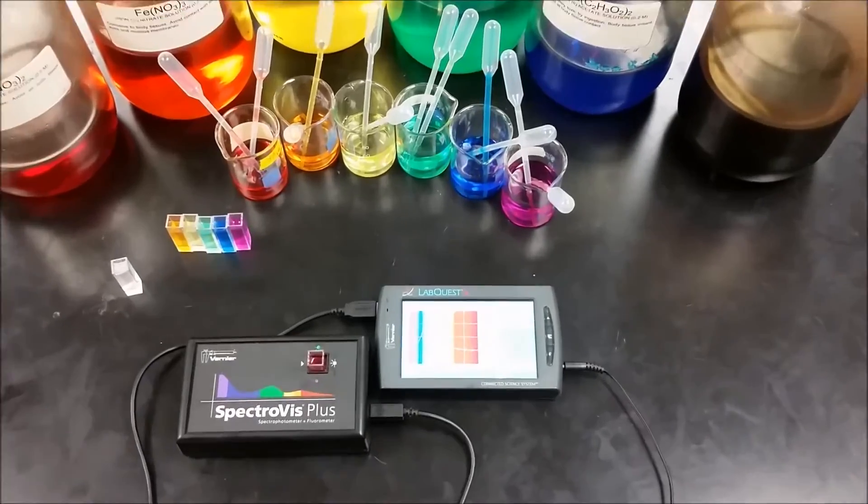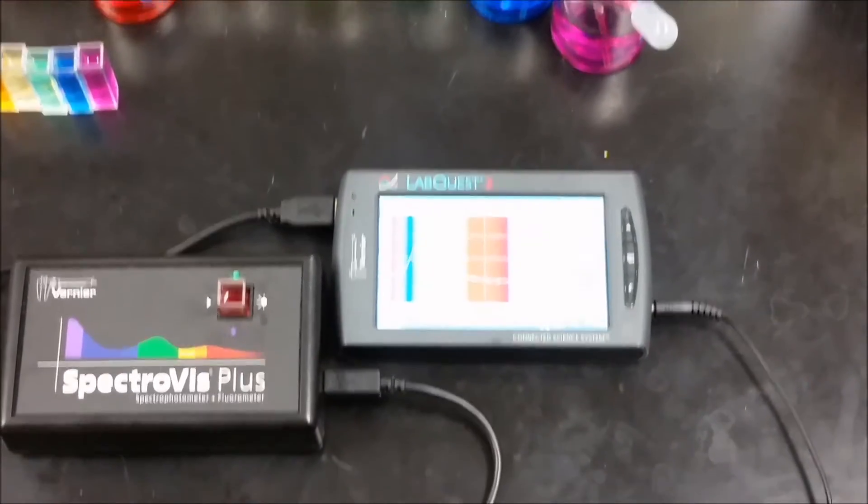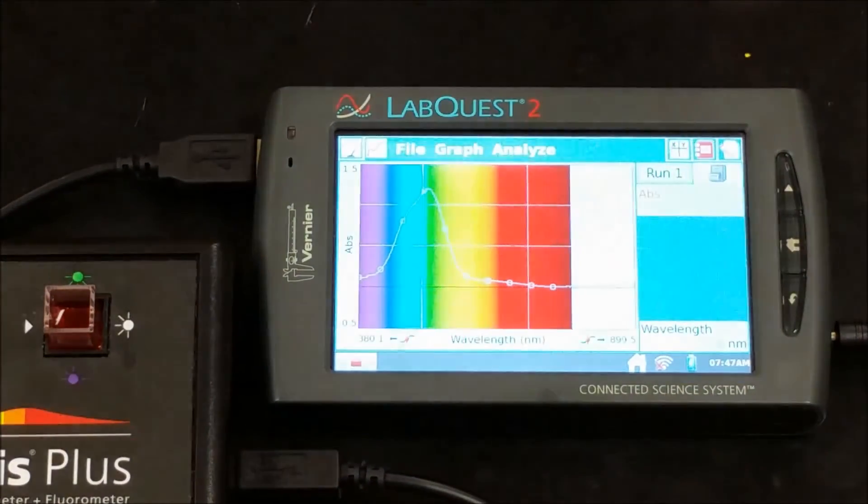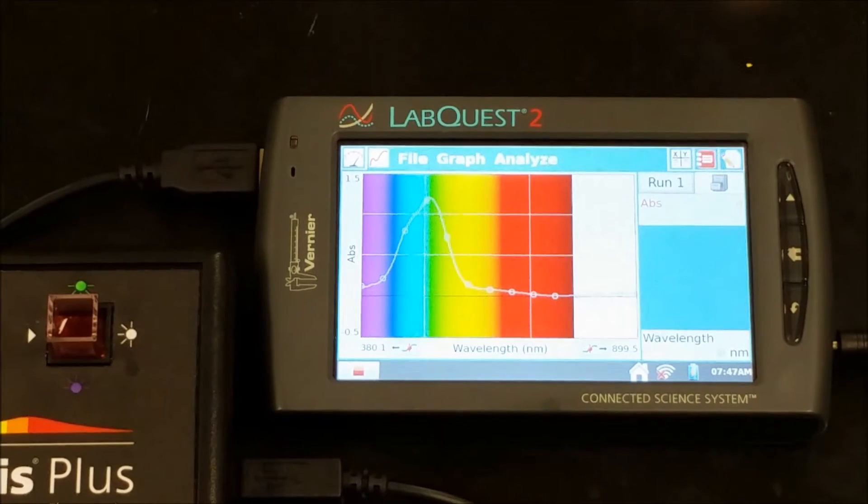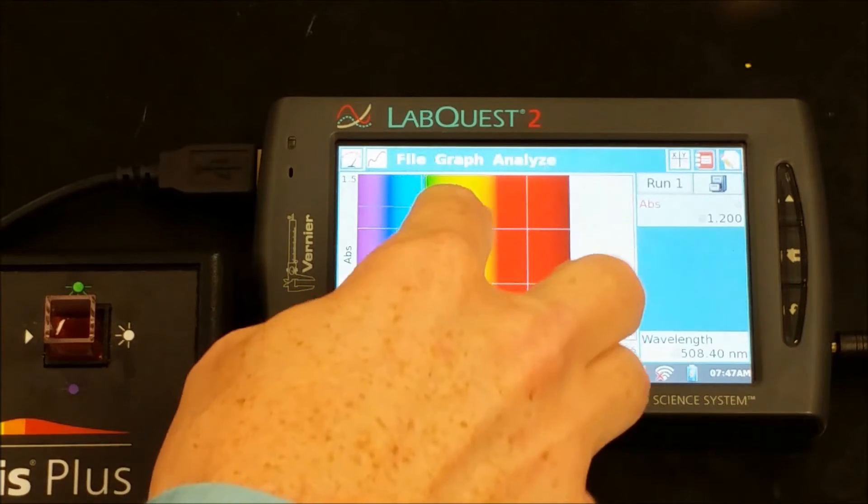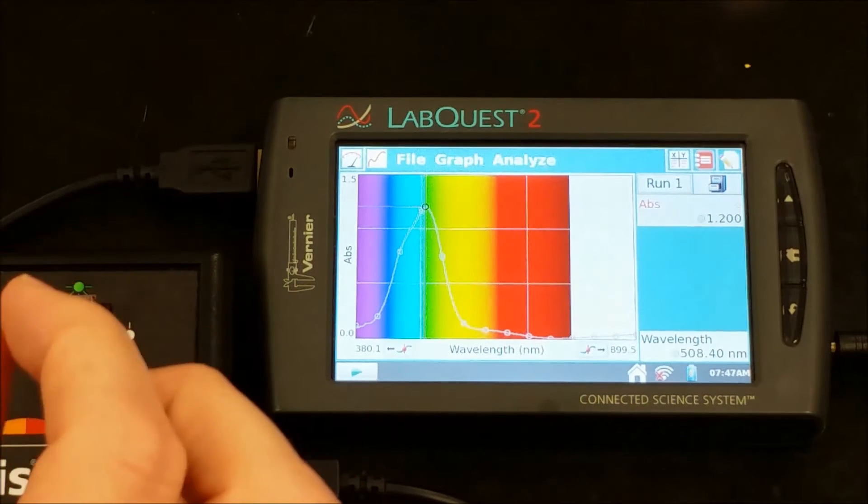Let's go ahead and zoom in so we can see that nicely. If we hit stop here, what we see is that we have a peak right in that green-blue barrier.